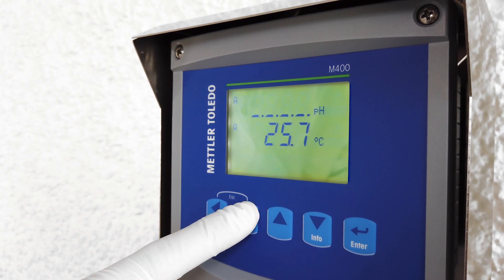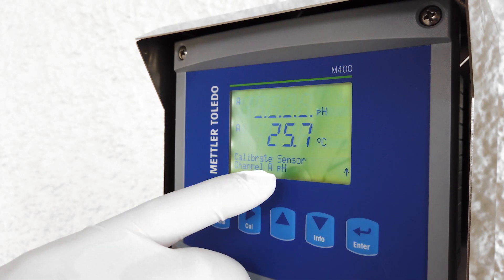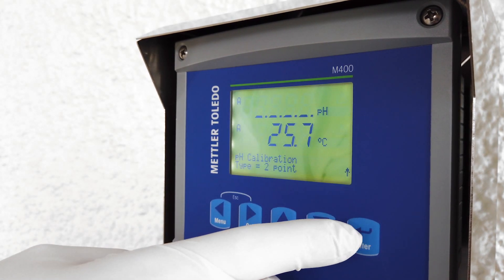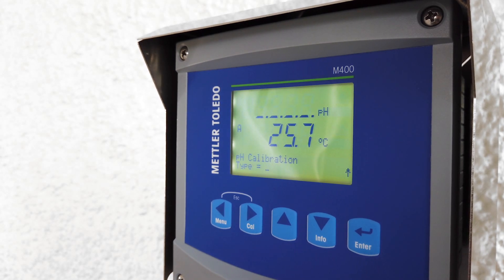On the transmitter, select the calibration menu by clicking on the calibration button. You will be required to pick the channel the sensor is connected to. Since this is a one-channel transmitter, you have only one channel, so select channel A, then select two-point calibration and press enter.